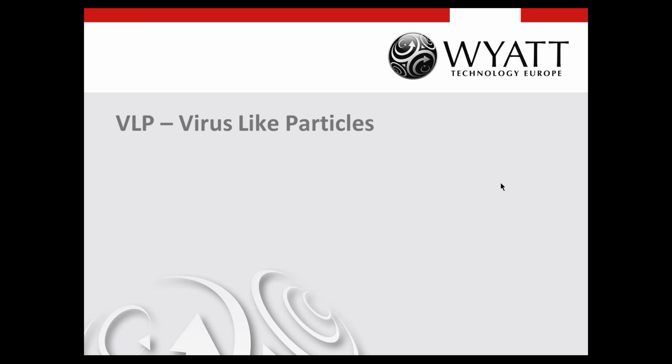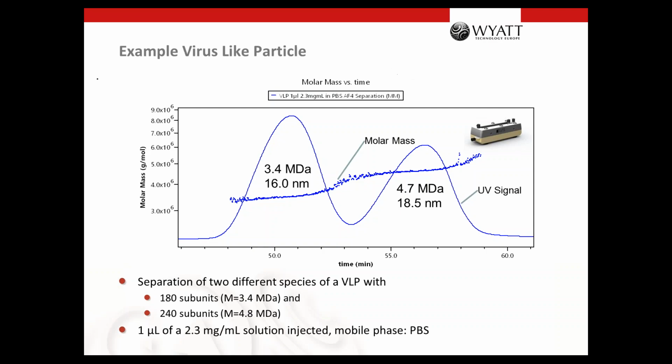Another example I want to show you are virus-like particles. Normally you have a protein which forms these particles, and then you produce that, put that in solution, and then it forms this virus-like particle automatically. These are usually very huge particles of 20 to 100 nanometer, depending on the kind of particle you want to produce. And normally, if you use an SEC column with virus-like particles, they all elute in the exclusion volume. So no chance to separate them. But in FFF, that's possible.